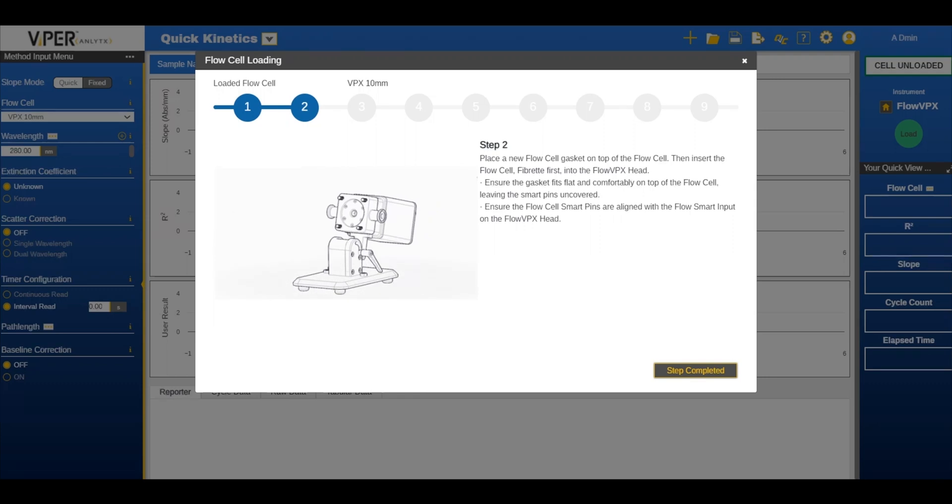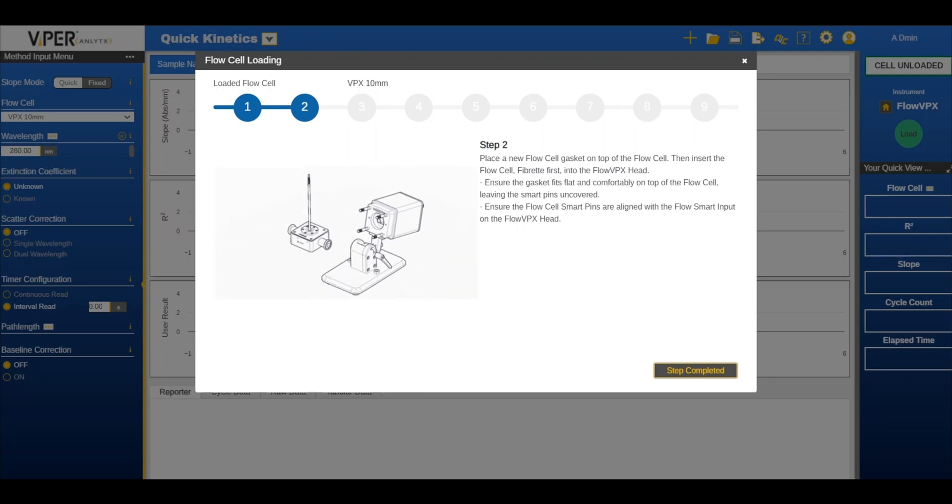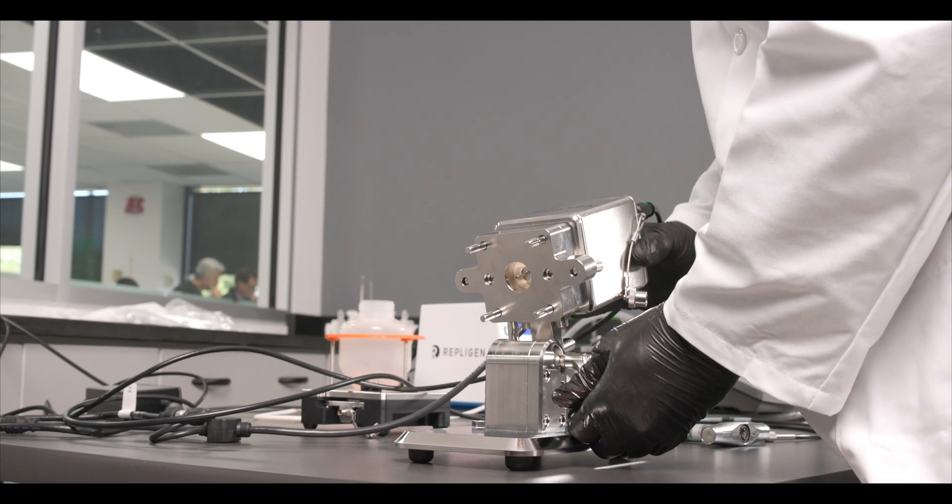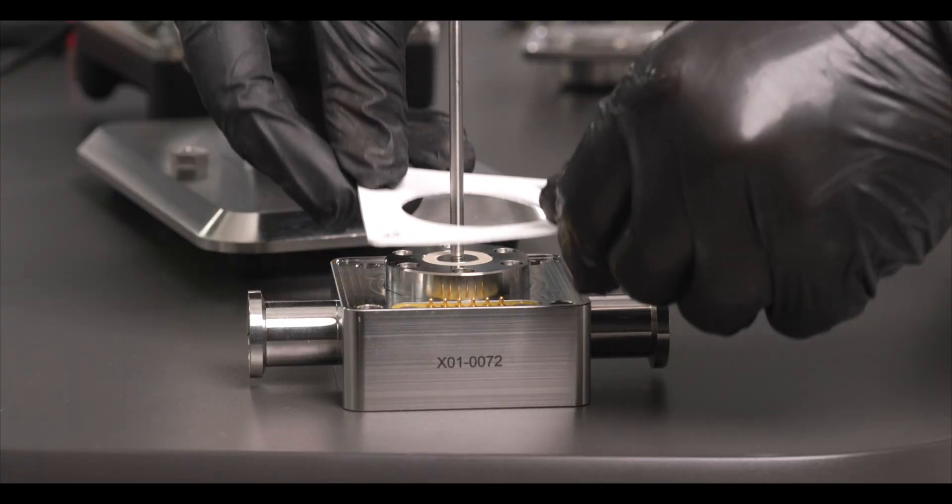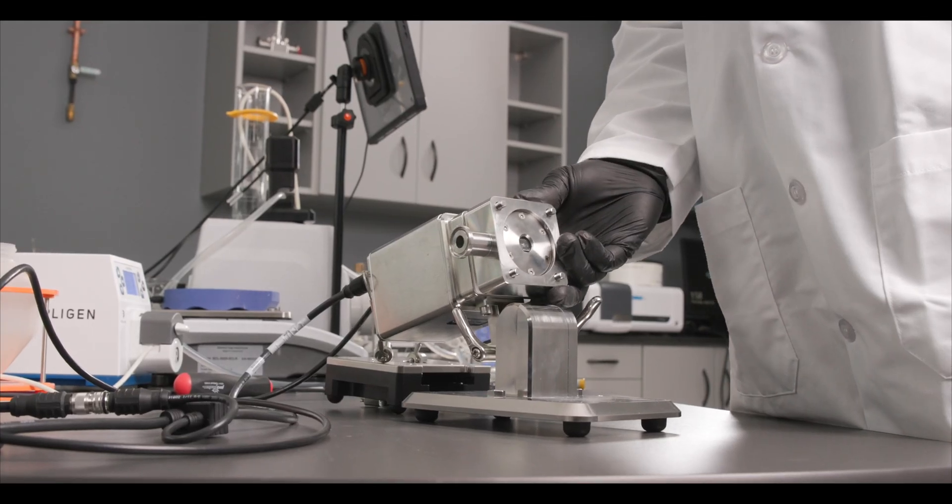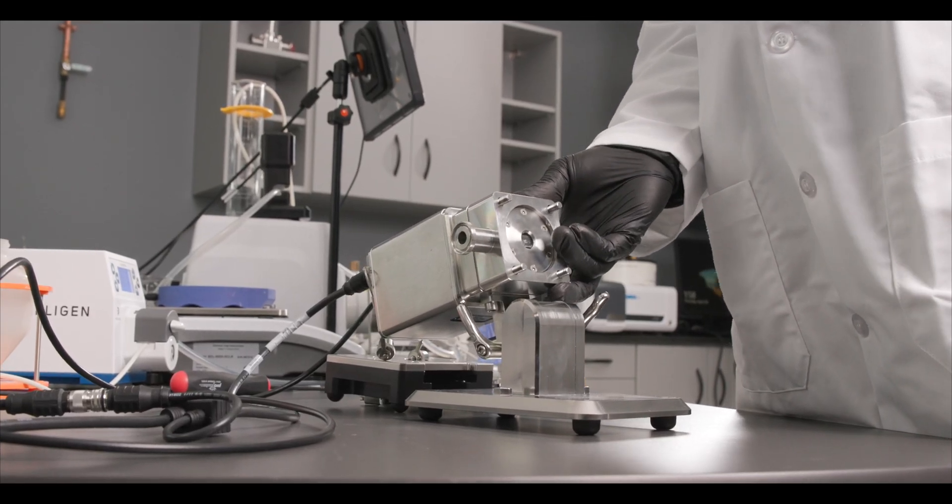Before starting the run, properly load the connected flow cell with the Viper software. Refer to the FlowVPX system hardware manual or video on the subject for complete instructions.